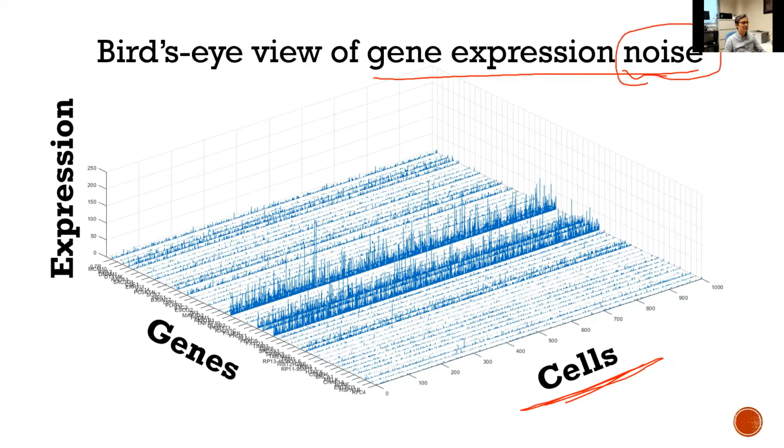Okay, so this is an example of selecting genes across those cells and looking at their different expression. You see some genes expressed at a high level overall, but all those genes have variability across cells.